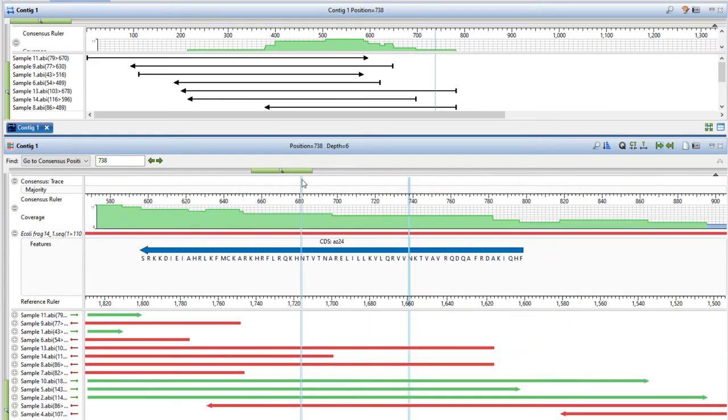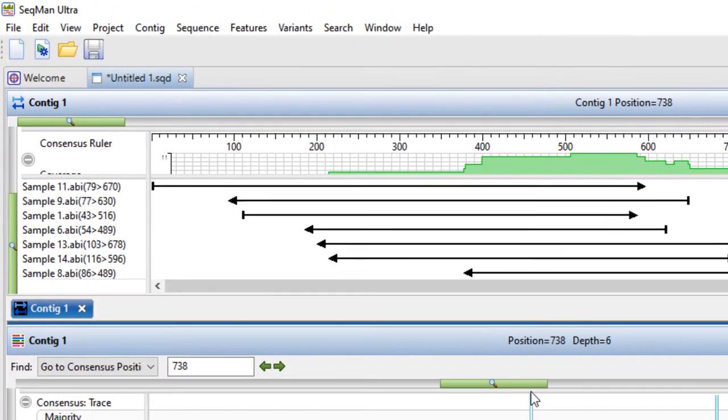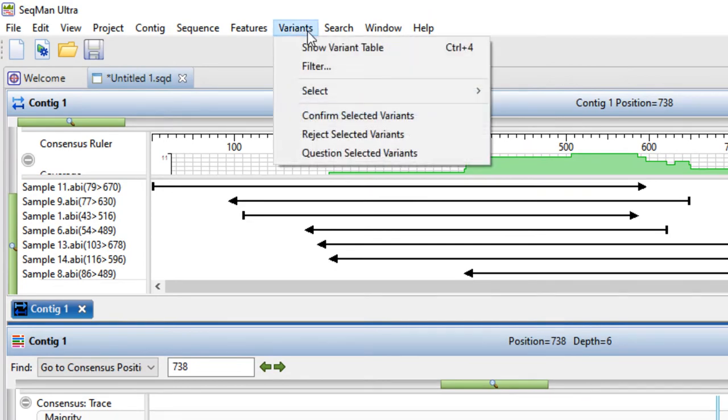To view a report showing all variants in the assembly, use the variants show variant table command.